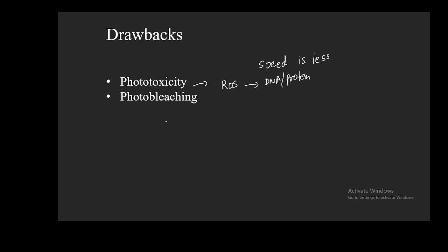The next is photobleaching, the destruction of the fluorophore. You are exposing your fluorophore molecule for a longer duration of time, and because of the photochemicals, there will be destruction of the fluorophore. So you can write here, this is the destruction of fluorophores because of the photochemicals.